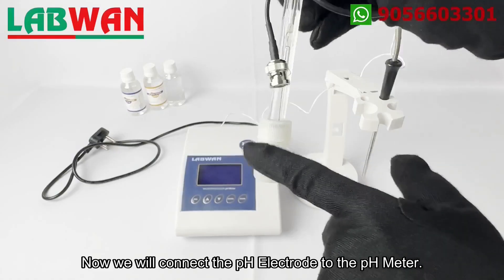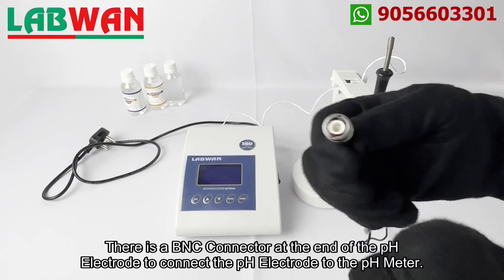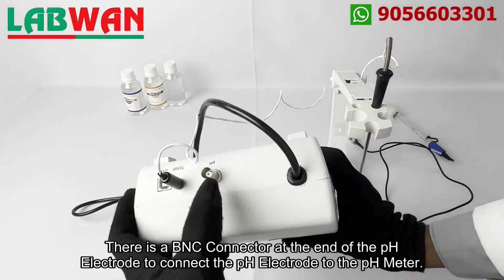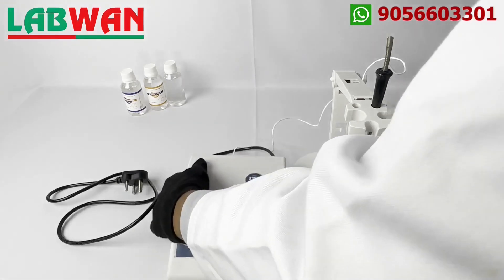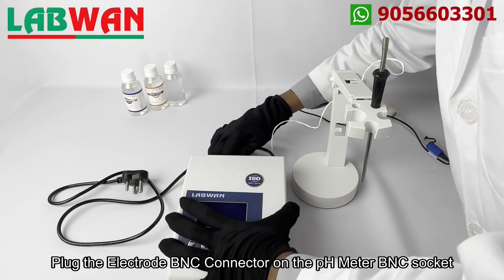Now we will connect the pH electrode to the pH meter. There is a BNC connector at the end of the pH electrode to connect the pH electrode to the pH meter. Plug the electrode BNC connector on the pH meter BNC socket.